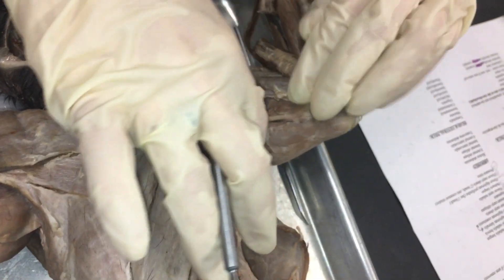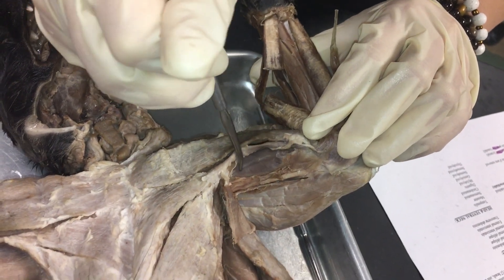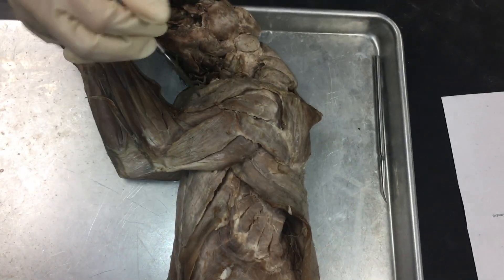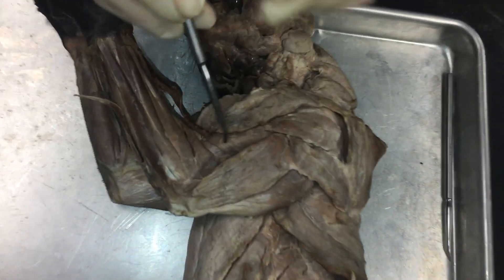Pulling that back underneath, this muscle here is biceps brachii. If we turn it around to the outer portion of the arm, we can see brachialis right here.